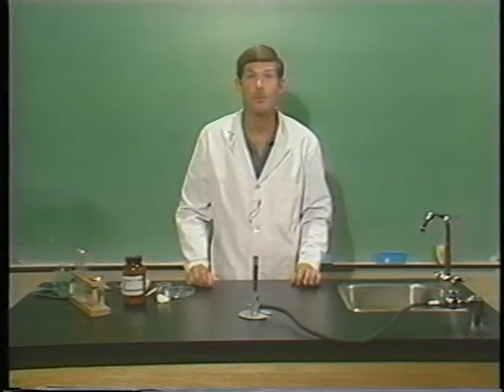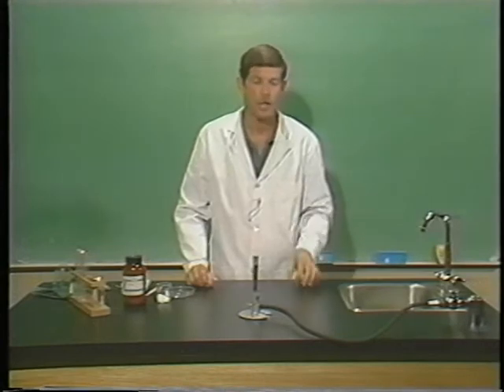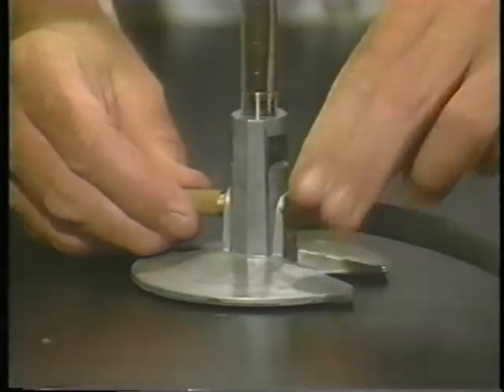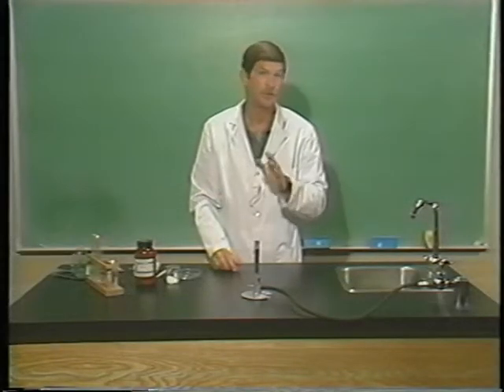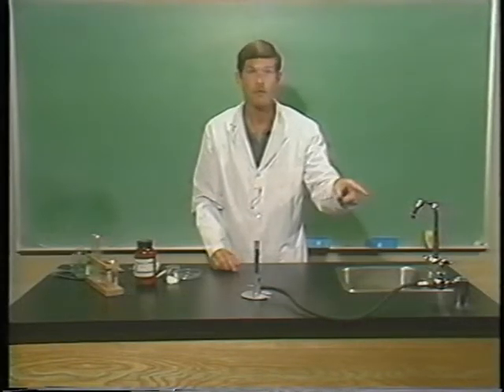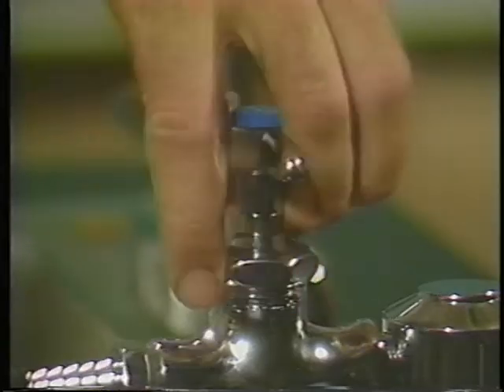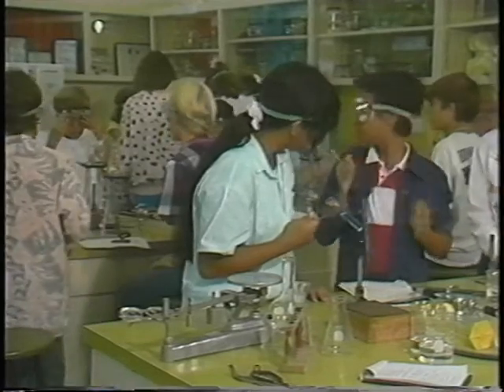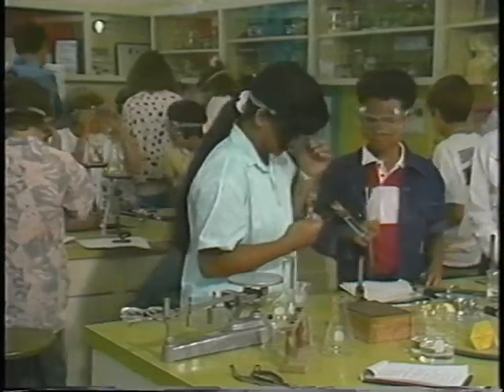So it's important that you're prepared for any emergency. If you're working with a Bunsen burner like this one, you should make sure that the hoses are on tight. And if you ever have a malfunction like the one we just saw, always head for the main gas valve and turn it off there. And if you're working with a Bunsen burner and you have loose clothing, be sure that it doesn't get in the way of the flames. If you have long hair, you should have it tied back.